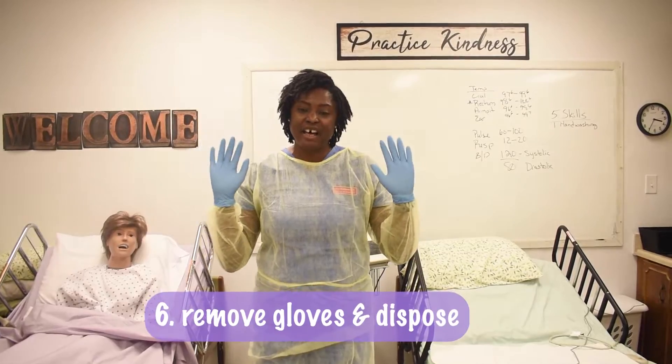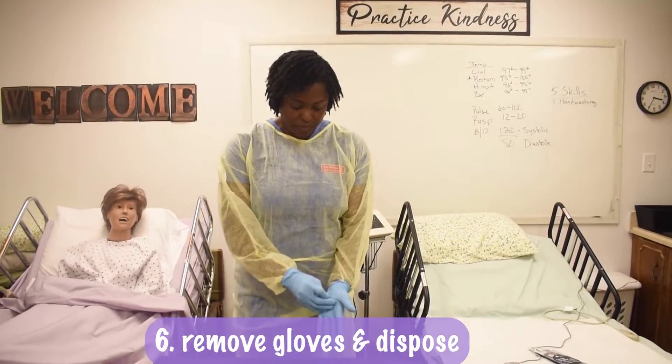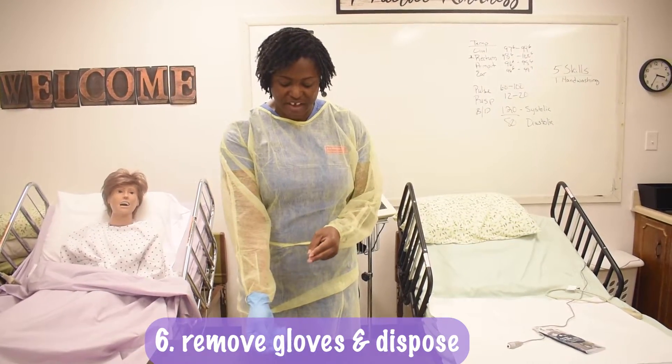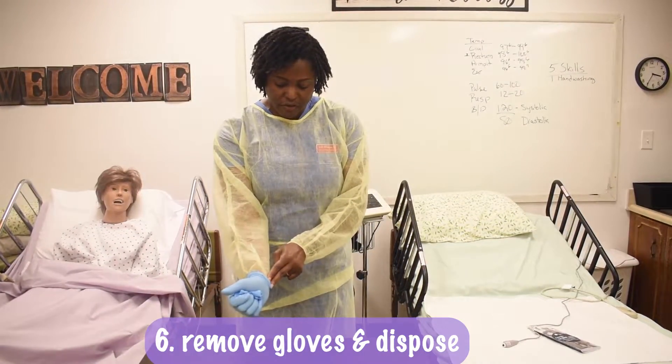We remove our gloves first because they are soiled. Grab in the middle, pull straight down away from our face, then two fingers underneath.